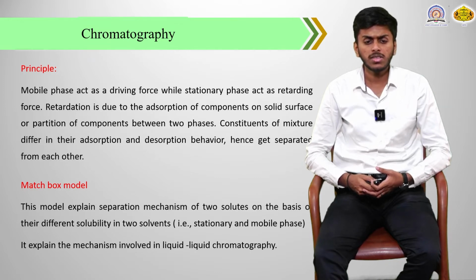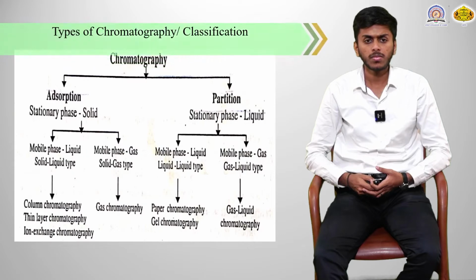Matchbox model. This explains the separation mechanism of two solutes on the basis of their different solubility in two solvents, that is stationary and mobile phase. It explains the mechanism involved in liquid-liquid chromatography.